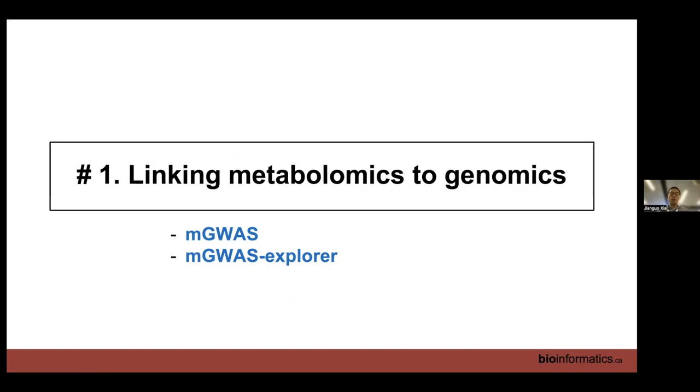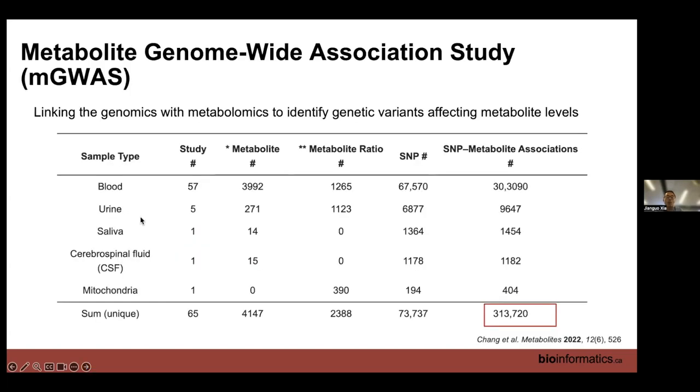Before, I already mentioned joint pathway analysis, which aims to link metabolomics with transcriptomics based on the significant genes and metabolites or peaks. Now, the main part here is linking metabolomics with SNPs. In genomics, we focus on SNPs, which have some downstream functions. What the field tries to do using genomics and metabolomics is called mGWAS. Basically, they call it metabolomics-based genome-wide association studies.